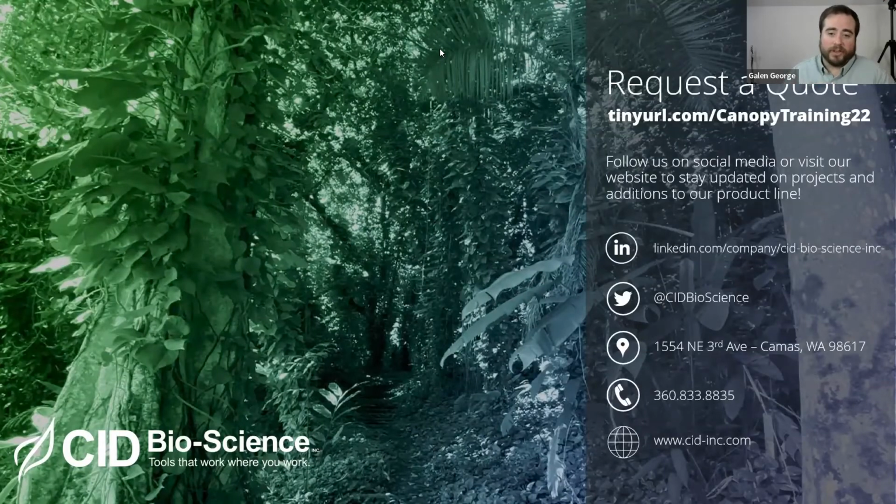One of them was a stone fruit orchard, I believe. I highly recommend watching it if you want some really good advice on best uses of this instrument in orchard applications. Michael, if you could post that link in the chat, that would be great.